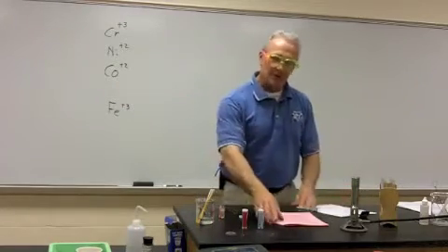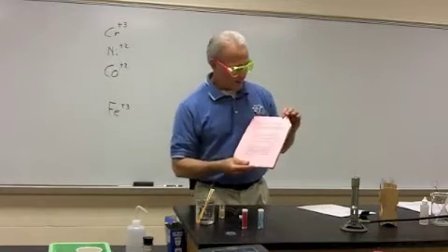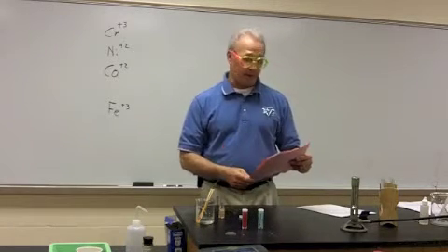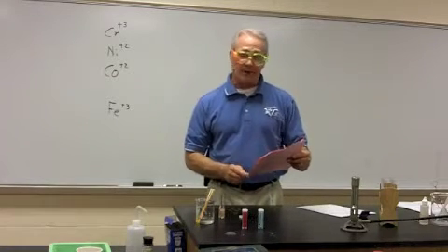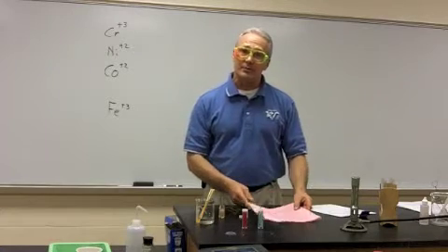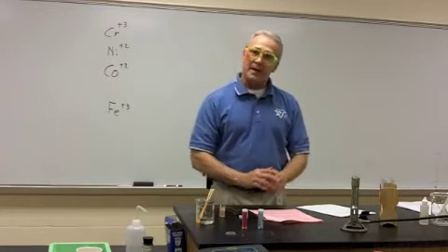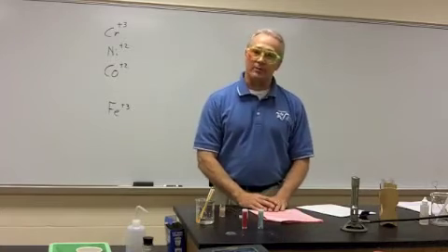So this is where I suggest you do what's called creative browsing. You go through your booklet, and I'll have you turn to page 7 in particular, and we'll read what it says about nitrate. As it says on the preliminary test, concentrated sulfuric acid reacts with nitrates to produce a yellow-brown gas. Dilute sulfuric acid usually does not produce a colored gas. That's how our unknown behaved with the con and dilute acid test. So we suspect nitrate. So the logical thing to do would be to test for the nitrate ion.